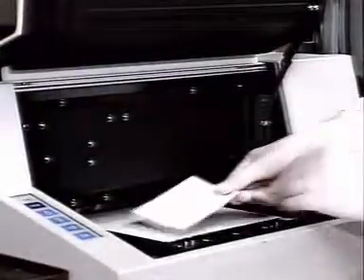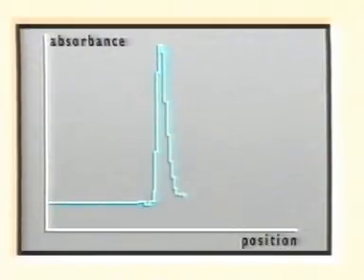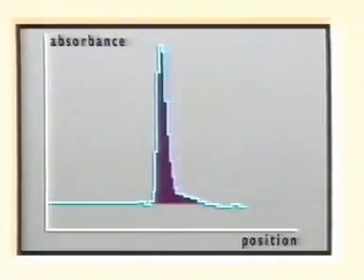The amount of protein is estimated by measuring the density of the coloured line on a densitometer. A spot of light shines onto the nitrocellulose. The dark-coloured line absorbs some of the light so that less passes to the detector. The quantity of protein is related to the amount of light absorbed and to the area under the peak of the curve.